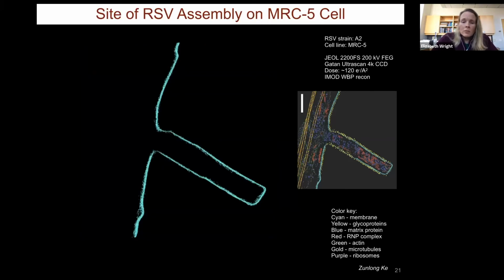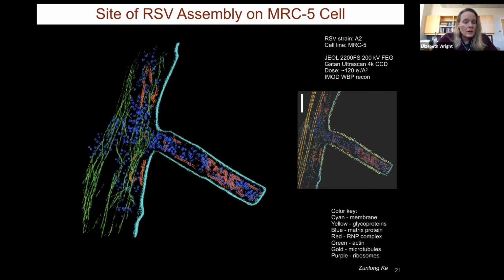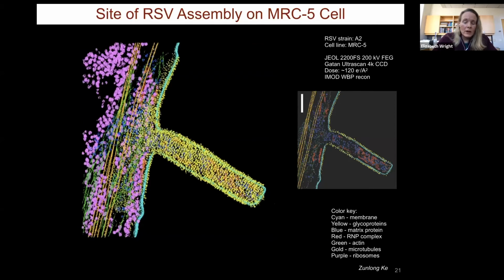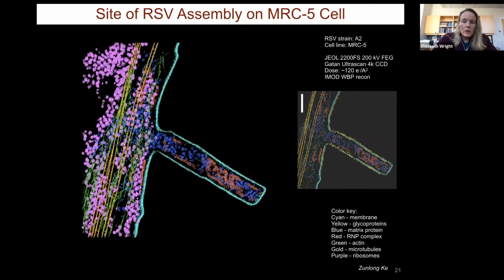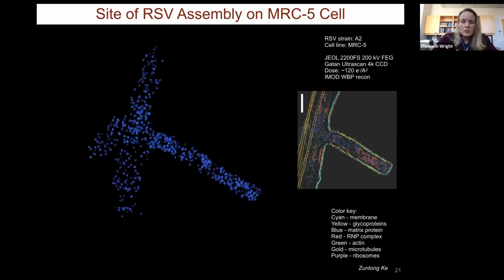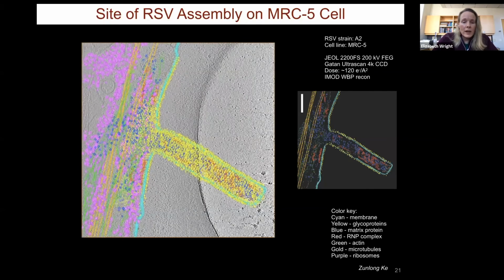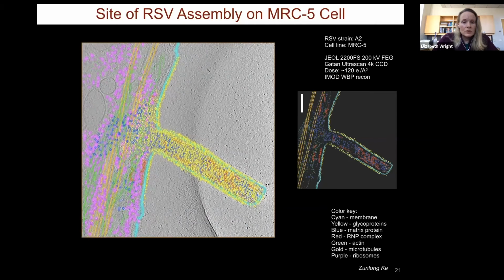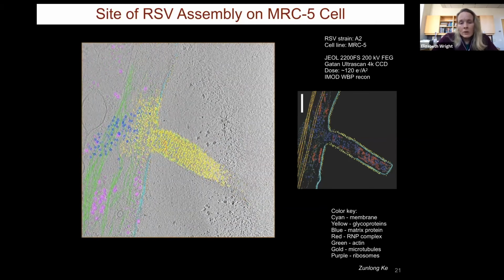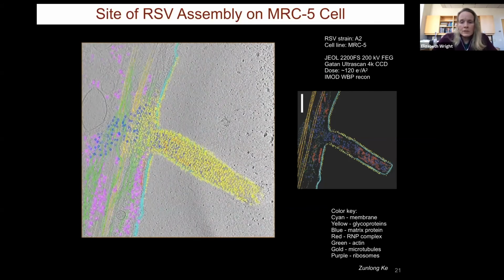Here is just a brief movie illustrating the value of using cryo-ET to investigate a whole cell in the process of virus particle assembling. And so we can segment these structures that are of interest inside the cell to help us understand what's at a site of virus assembly. So the microtubules, the actin network, ribosomes, and many, many other structures that would be present, as well as all the viral protein structures that have been recruited and assembled to those assembly sites.